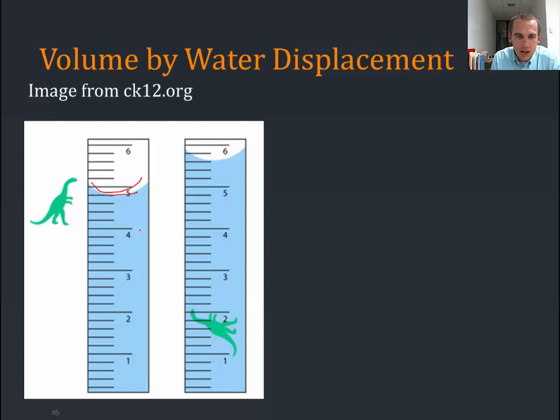If you look here, this is four. We're going to go with milliliters. This is five. I have one, two, three, four, five lines between them, which means this is two, four, six, eight, ten. So this is 4.2, 4.4, 4.6, 4.8. So that tells me there are 4.8 milliliters of liquid in this graduated cylinder.